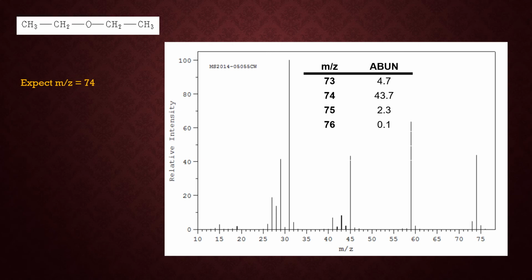But if you think about it, that's like one of the ethyl fragments coming through with a proton attached, or 2 protons attached to it. So chemistry is taking place. The molecule is getting beat up in the beam, so the ether bond is getting beat up in the beam, and the molecule is fragile.